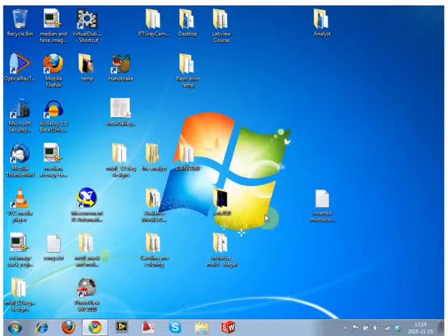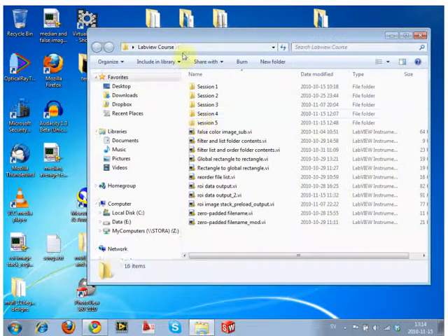Okay, so this is session 5, the final one in this. And we're basically gonna look at expanding what we have right now to incorporate other options. If you look at your handout, I'll pull it up on the screen.